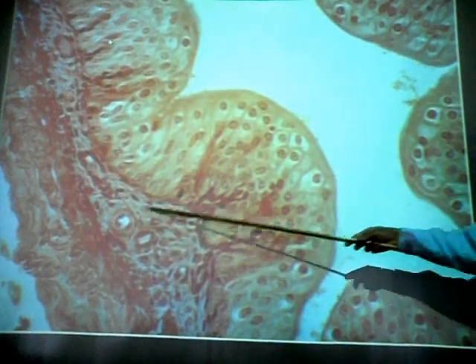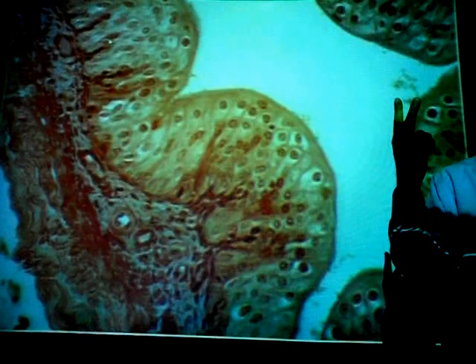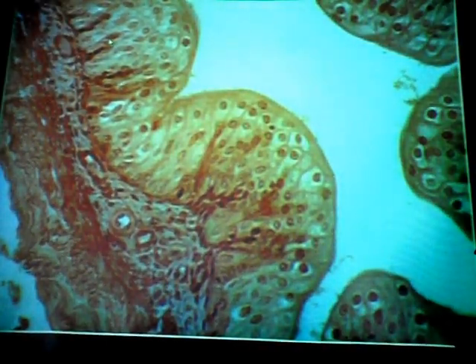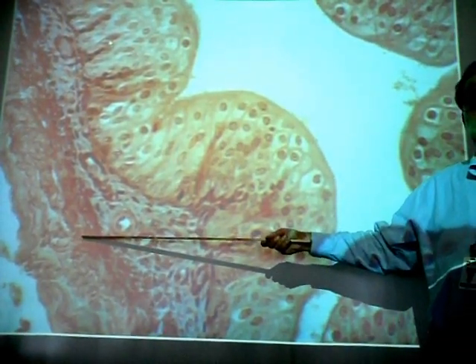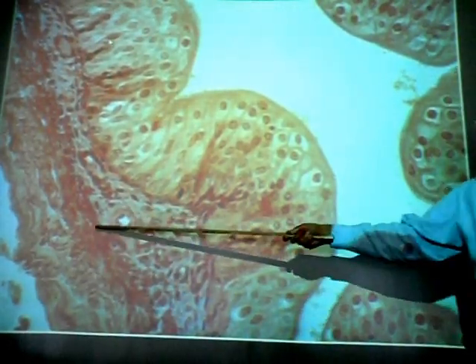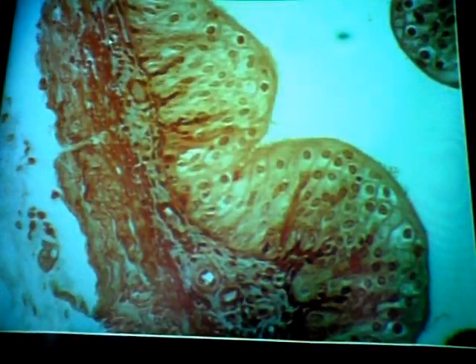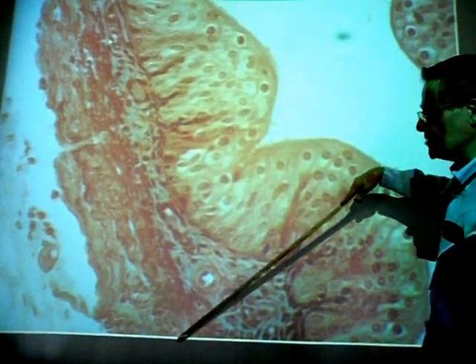Then external or deep to that, we've got our muscle layers. Again, it's smooth muscle. We've got two layers here. If I ask cell type, you would say smooth muscle. And the arrangement, how are those fibers running? The inner one is longitudinal. Unfortunately it's not circular, which you learned in the GI tract, it's just the reverse. So it's inner longitudinal, then outer circular.